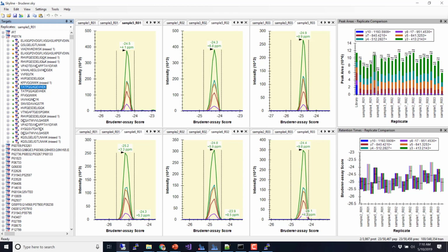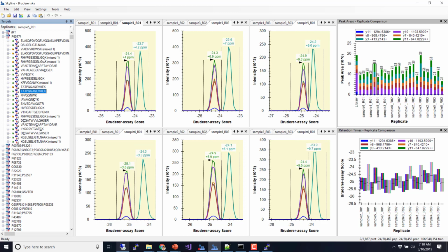We're a little confused by why there is no Y10. We're expecting a lot of Y10. So that's potentially not our greatest match either. Here again, super consistent, right? This is a different peptide. It may not be close to, we get a little bit from it. Mostly we seem to be chromatographically separated from it, but it's a concern.